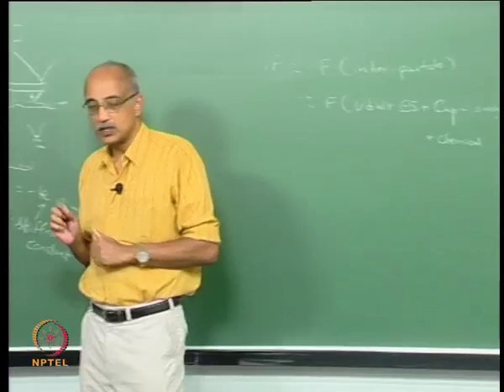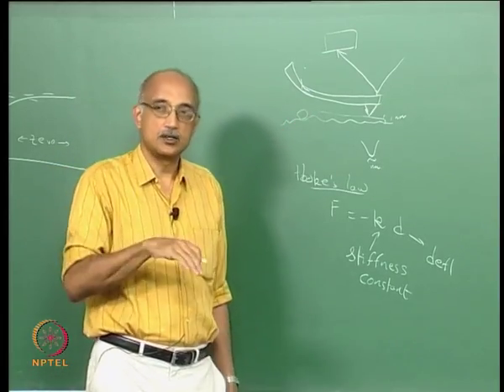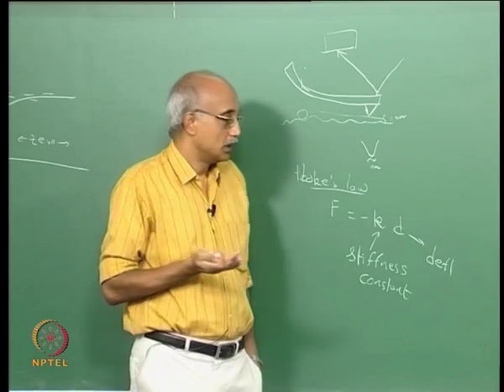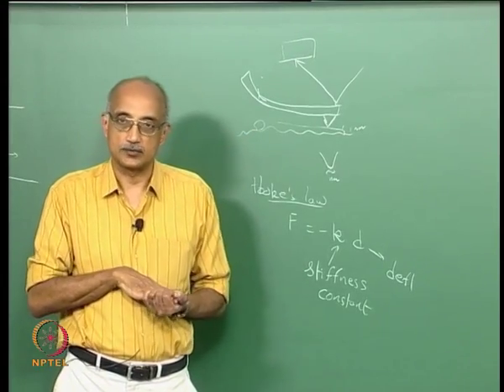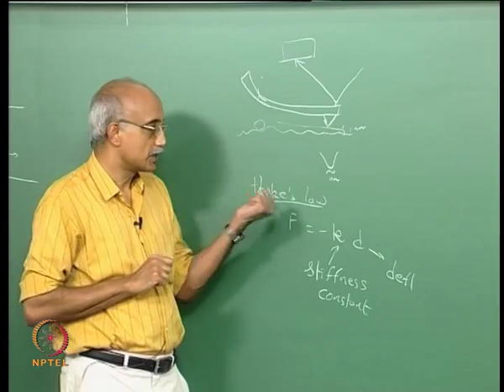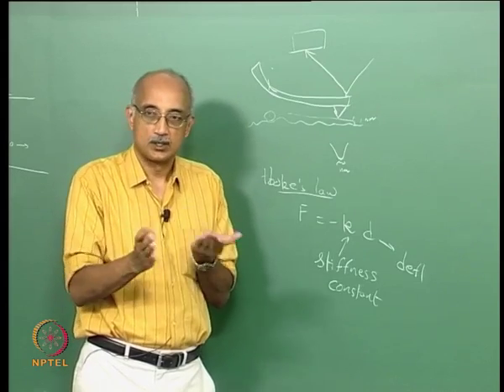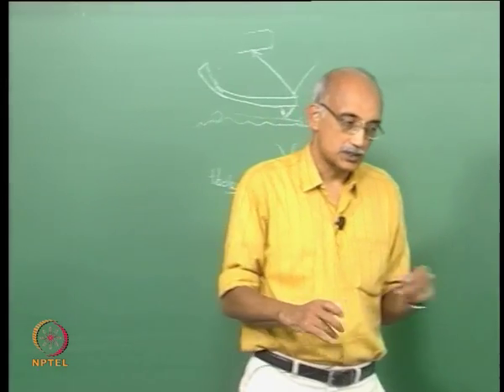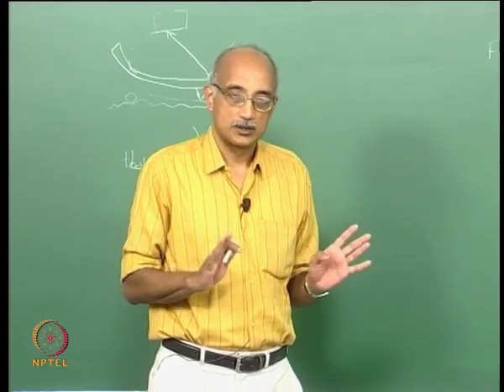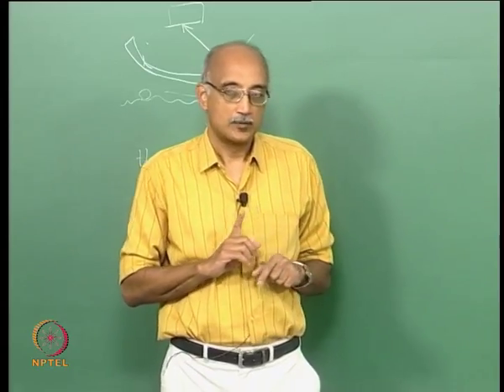Now, atomic force microscopy, one of the requirements though is that it can sample surfaces very easily, but supposing you are trying to characterize a particle that is sitting on a surface, can we do that using an atomic force microscope? Well, the key thing is that the particle must not move during the sampling. So, it must be held in place, which means it can certainly be used for particles that are strongly adhered to the surface. But for particles that are very loose on the surface, the use of an atomic force microscope involves some risks, because as you bring the probe close to the particle, it can actually knock the particle off the surface by exerting sufficient force on it. And so if you want to analyze surfaces, or if you want to analyze strongly bonded particles to surfaces, there is no problem with using an AFM. But if you want to characterize loosely held particles on the surface, then you can still use the AFM, but you have to use it very carefully.